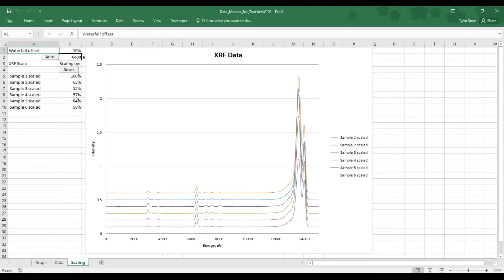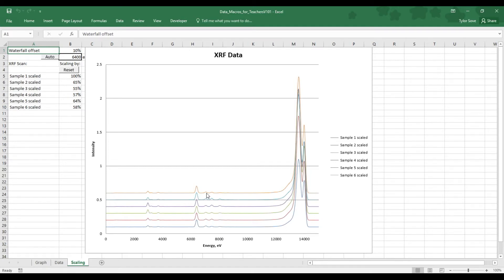As we can see right over here, the scaling numbers are no longer 100%. This will allow you to compare elemental trends, neglecting all effects of the detector and the detecting program, and so on.